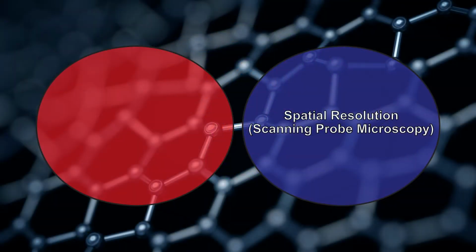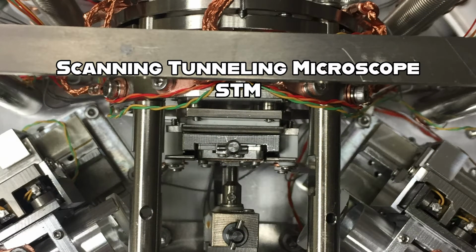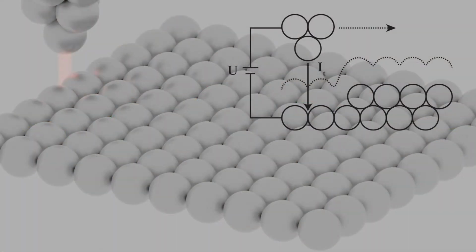Analytical methods primarily fall into two categories. On one hand are techniques that offer supreme levels of spatial resolution, capable of resolving single molecules and even single atoms. As one half of the technique I apply in my research, I want to highlight the scanning tunneling microscope, or STM. The STM enables the real space imaging of surfaces at the atomic level.